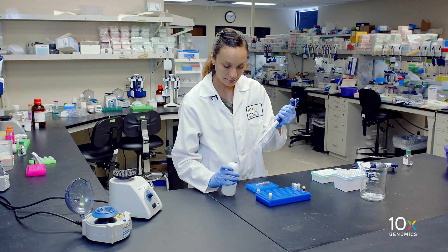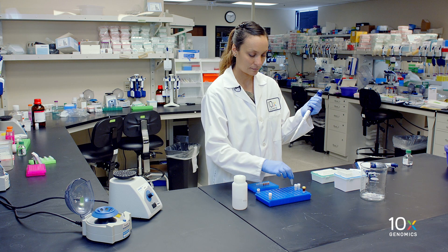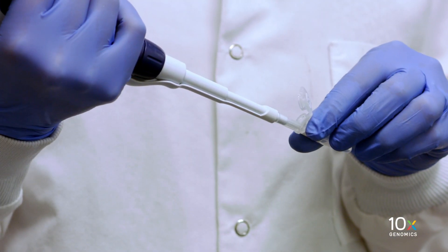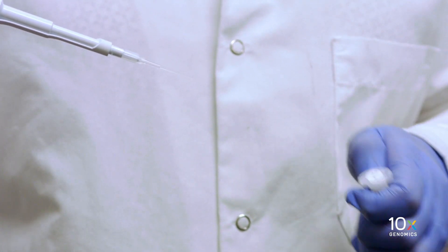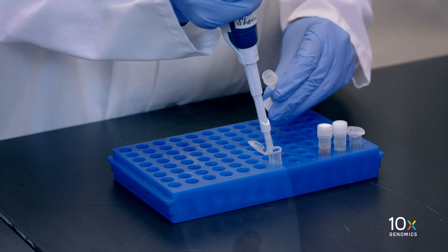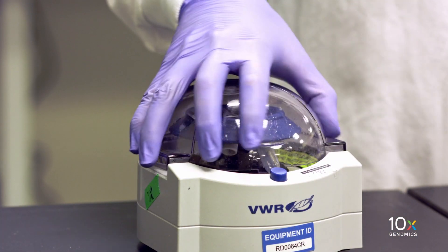While the DynaBead cleanup mix is incubating, we'll prepare Elution Solution 1 by adding the reagents in the order shown in the user guide. We combine buffer EB, 10% Tween 20, and reducing agent B. Vortex mix thoroughly, then briefly spin down.